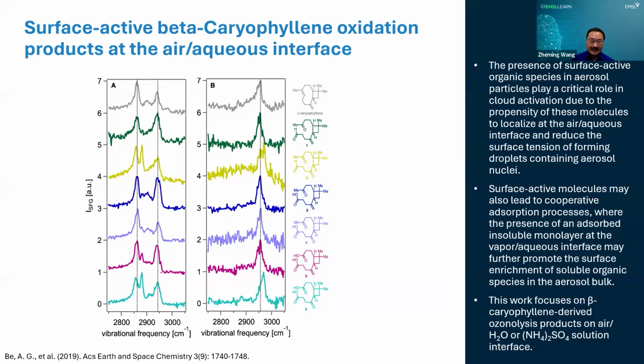We also see that through different polarization combinations, we actually get different spectra. In all the cases, the PPP combinations, the second column of the spectra, are relatively invariant. So for the rest of the presentation, I only show the SSP polarization combination. However, I should point out that PPP is very useful, particularly, though I will not present it today, because we can use this information to derive the orientation of molecules on the surface for specific systems.